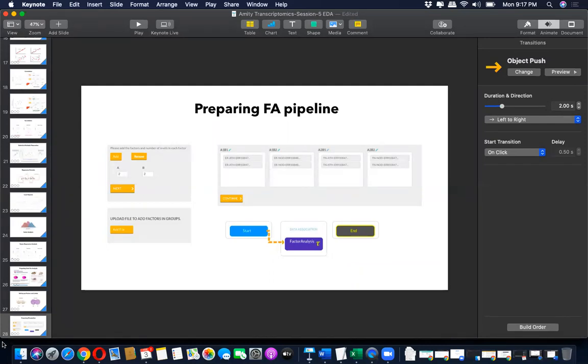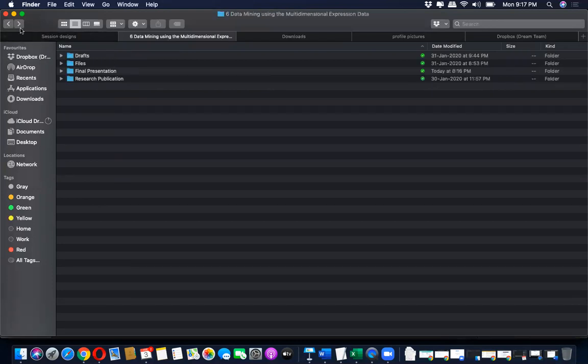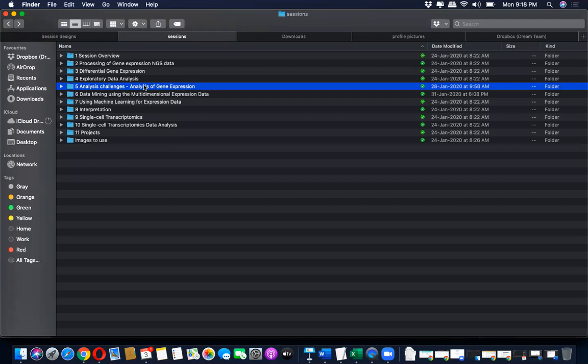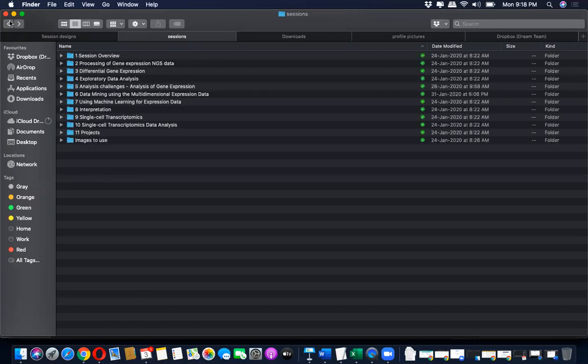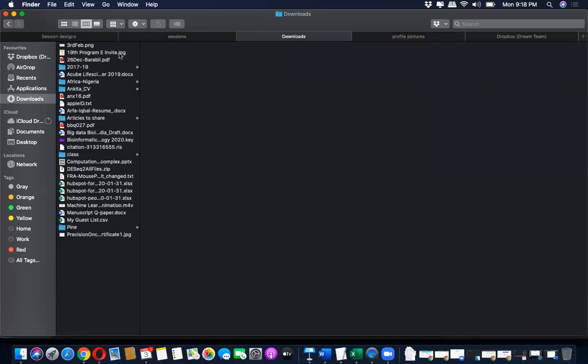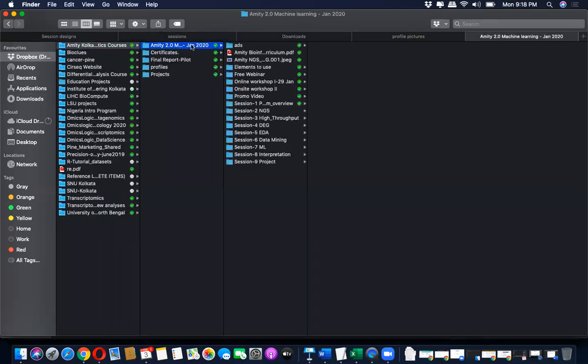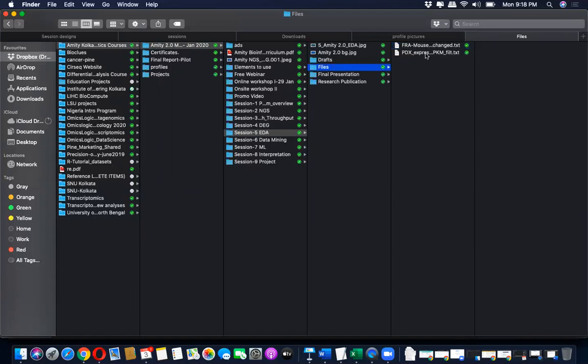So the name of the file is, wait, is this one? No, this one.